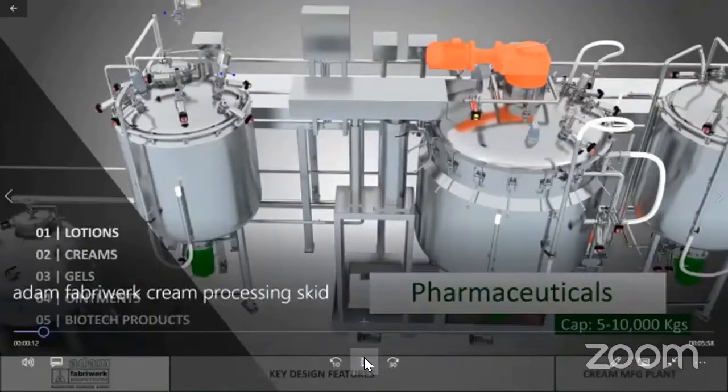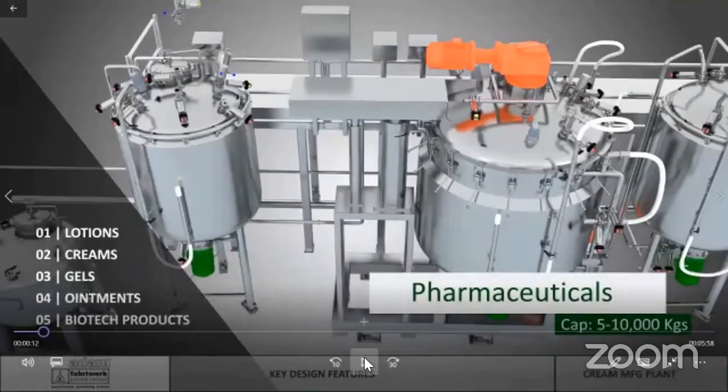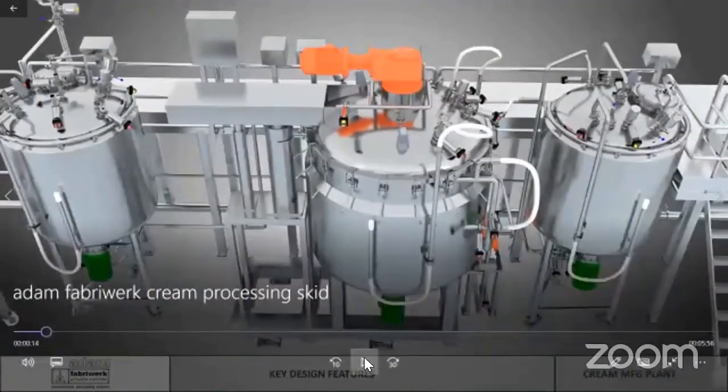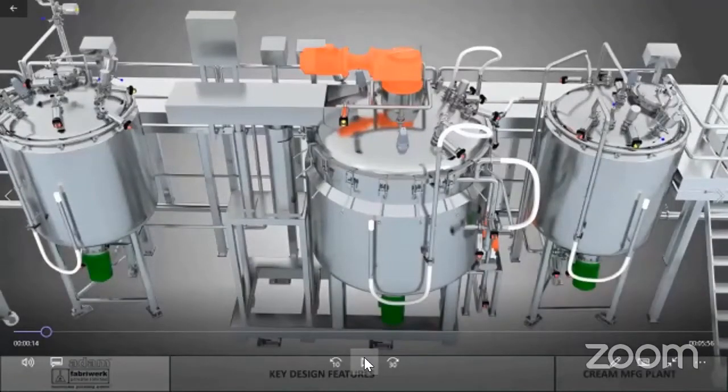What you see here is a typical cream and ointment plant for capacities ranging up to 10,000 kilos or 10 tons. The center one that you see is a material vessel, and the two vessels on the sides are the phase vessels, typically the wax and the water. In many markets there is only one slurry vessel, but most of the time in India and a few markets, we have seen usage of a separate water and separate oil or wax vessel. These are used independently in some formulations or combined in a slurry form.